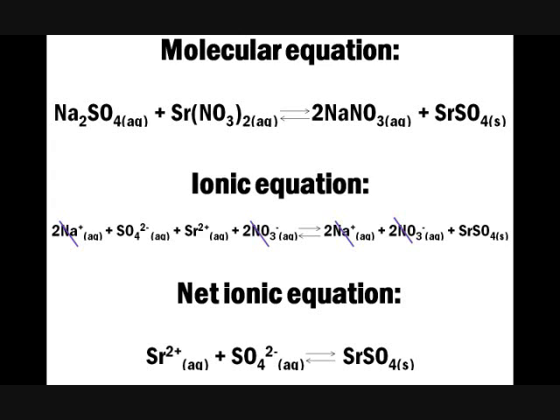When you mix two solutions of different ionic compounds that individually are soluble compounds, they form a new insoluble compound which produces a precipitate. Strontium sulfate is the precipitate formed in this case. The strontium sulfate is insoluble because the solvent has taken the utmost amount of solute in. The solution has reached the point at which the solvent can't dissolve more of that substance, and additional amounts of it will appear as a precipitate.